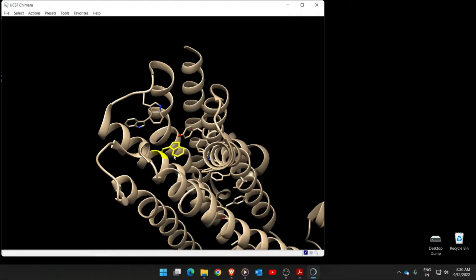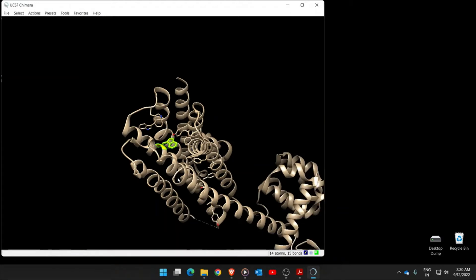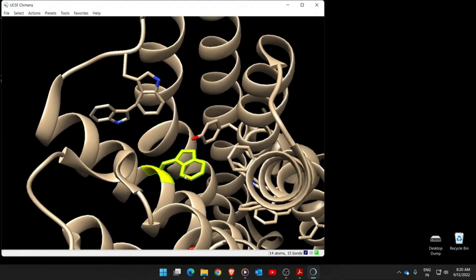Select this residue - the one highlighted in yellow that we replaced in the previous video. Press the control button and select any atom of this amino acid with a left click, keep control pressed, and hit the up arrow on the keyboard. This will select the entire residue, shown with green boundaries.